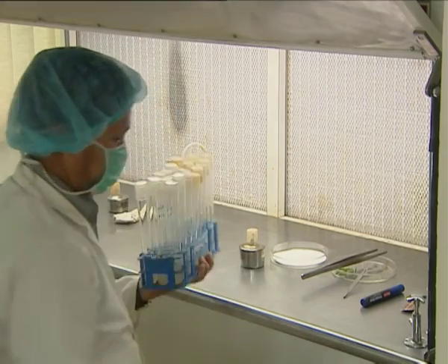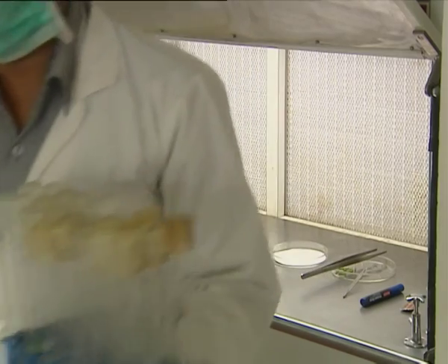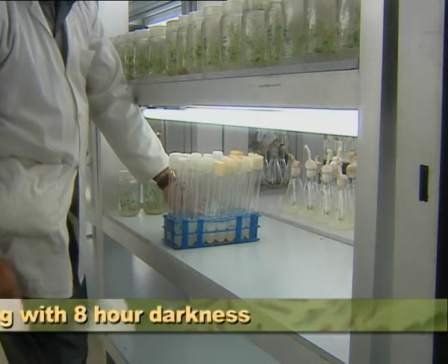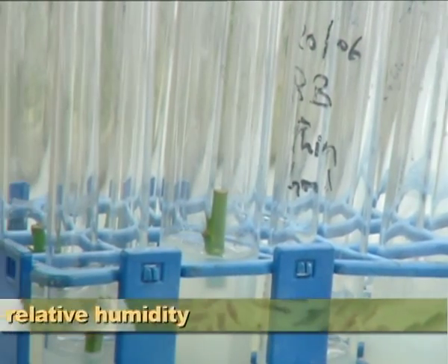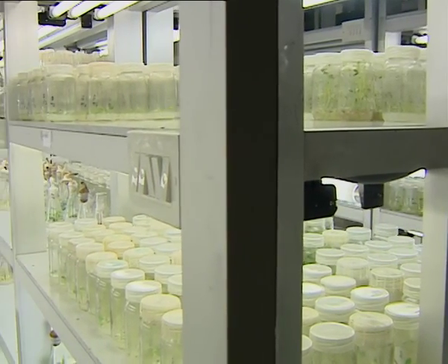The cultures are now ready to be incubated in the culture lab at optimum conditions of 16 hours light, alternating with 8 hours darkness, 25 to 27 degrees Celsius temperature, 40% relative humidity, and it is monitored timely.